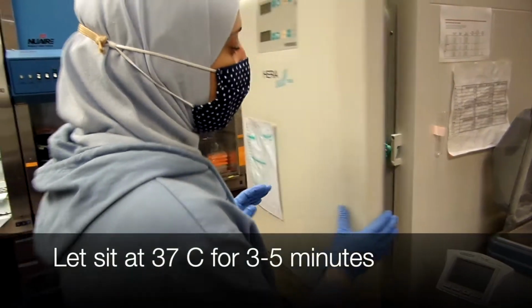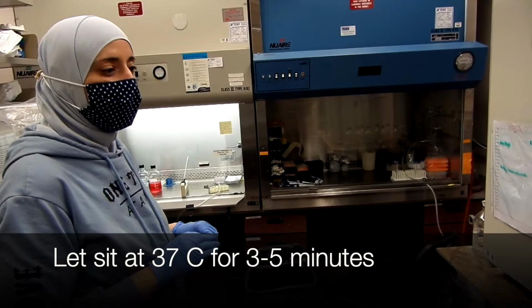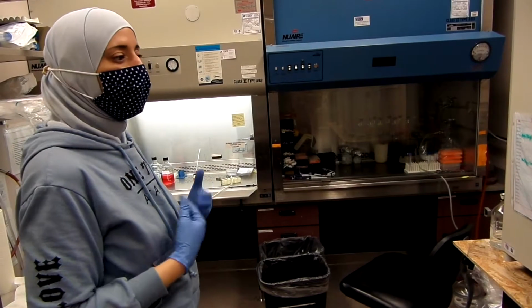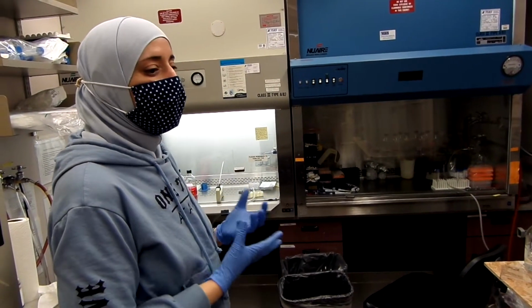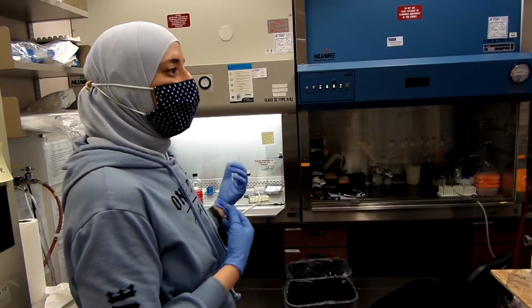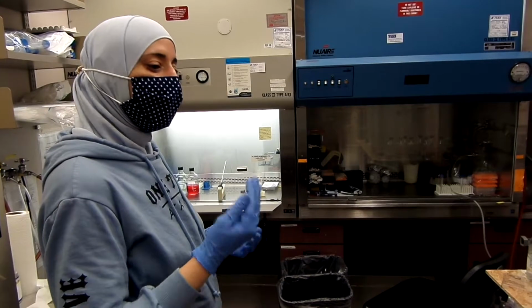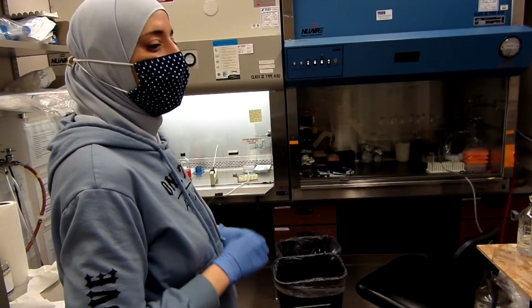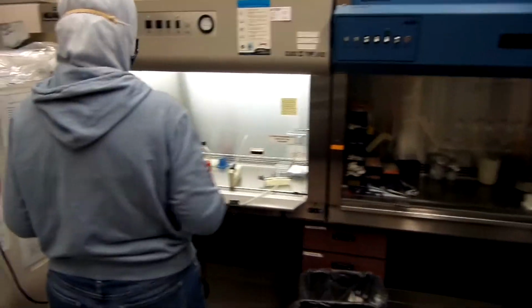We'll leave it in the incubator at 37 degrees for 3 to 5 minutes, until the cells start floating. More than 5 minutes will cause toxicity for the cells, and the cells will die because, again, trypsin is a general protease that will start not only breaking down the focal adhesion, but it will start working on the cells themselves. Meanwhile, you can prepare your plates.